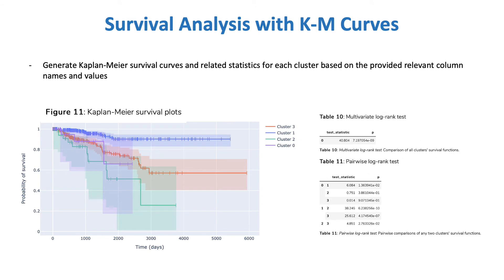I next use the clusters and relevant clinical information to generate Kaplan-Meier survival curves for each cluster, and output statistics indicating how different those curves are using both a multivariate and pairwise log-rank test. Here we can see clusters 1 and 2, and 1 and 3, have quite significantly different survival curves.